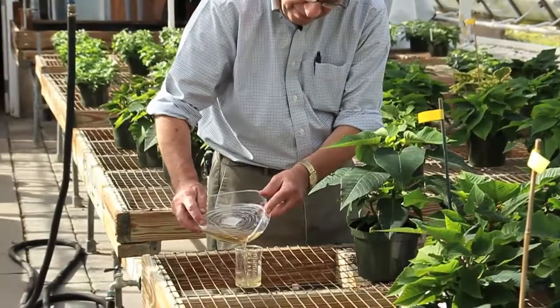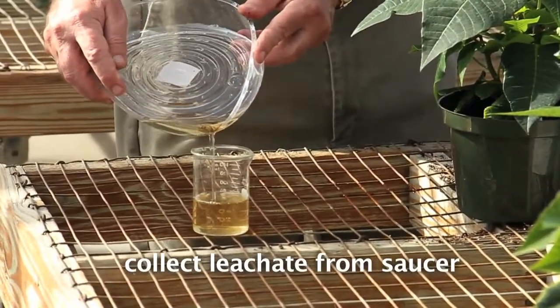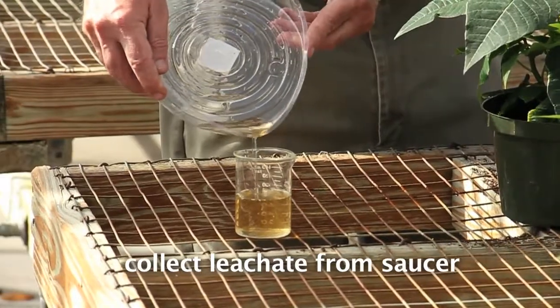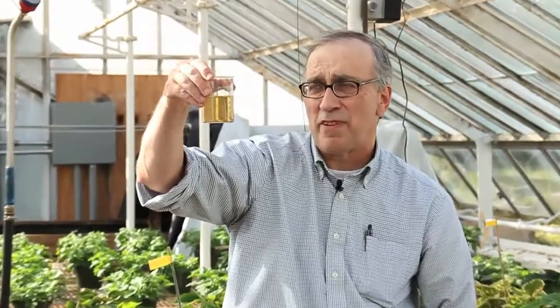You fill the beaker or measuring cup and see how much you've got. I went a little overboard — I got 75 milliliters out of this, but that's okay.